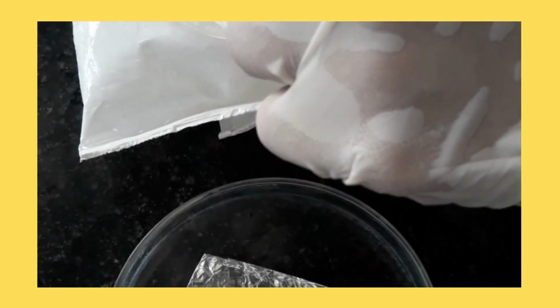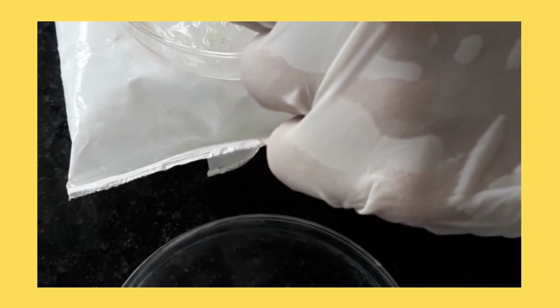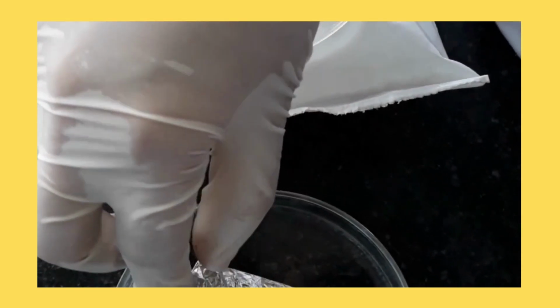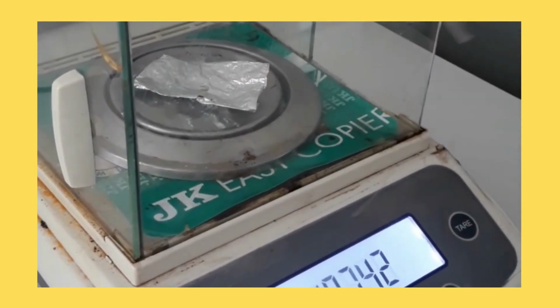Sample preparation. In sample preparation, first of all we have to dissect the fish and remove the gut tissue. Now weigh the fish gut tissue.